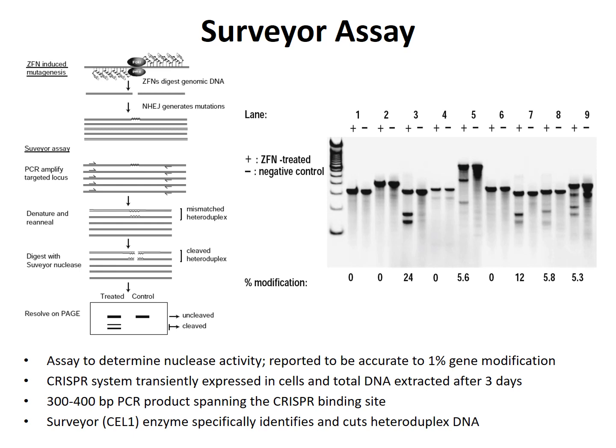And what that does is it identifies heteroduplex DNA and cleaves it. And then that cleaved DNA is what you actually quantify to look at the amount of nuclease activity. And you do this by simply running your PCR products out on a gel and using densitometry.